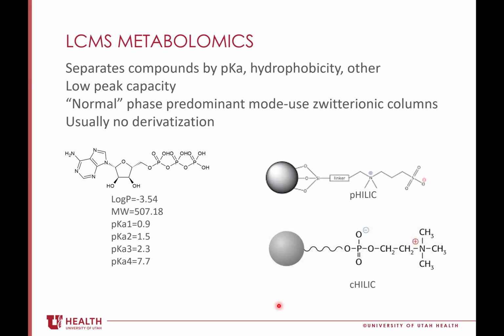Fantastic. Yeah, so LC-MS metabolomics is something we do a lot of as well. This really has some really strong advantages.